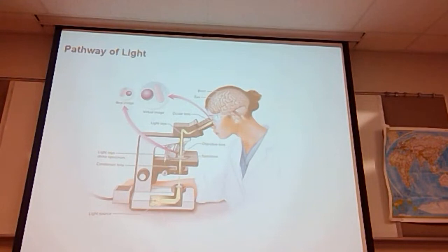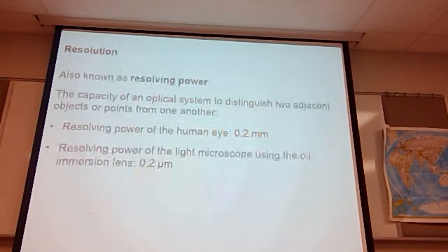You have an eye, you have a light, and in most cases you think the light is right down here under this objective. It's actually not. The light is back here. The light is actually shining and hits a mirror. That mirror then bounces the image up through the objective, through another set of lenses, where it hits off another mirror here and another mirror here, and then reflects into the eyepiece and the eyepiece lens. So look at all of these different things that could be jostled out of position by that microscope being handled roughly.